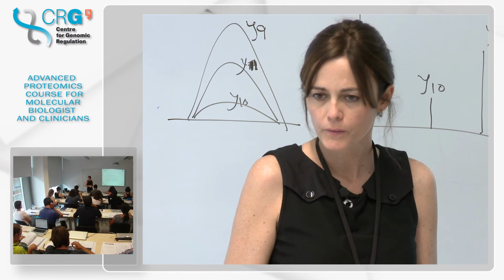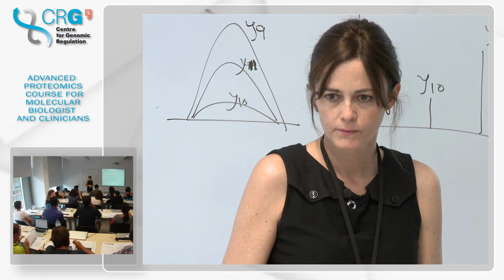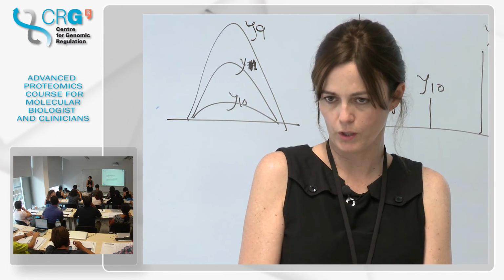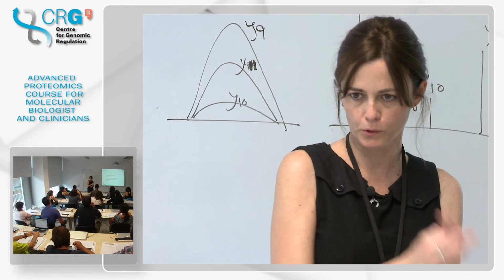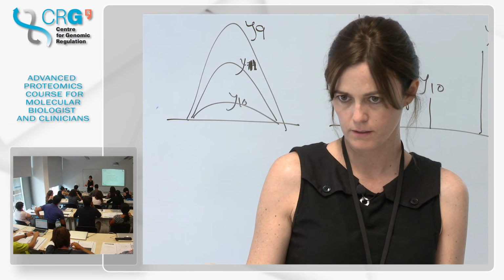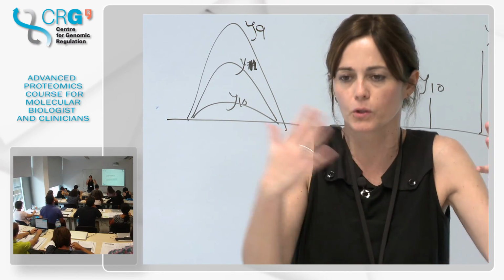And the matrix you use to do this, is it the same matrix of the original sample? Yes. Or the matrix that is going to go into the chromatography at the end of the sample operation. You want to test your heavy peptide in the most similar way to how you're going to measure your samples. So if you start with plasma and you deplete the most abundant proteins, you use that to measure your heavy peptides. After digestion, you do the whole sample processing, the same that you would do.